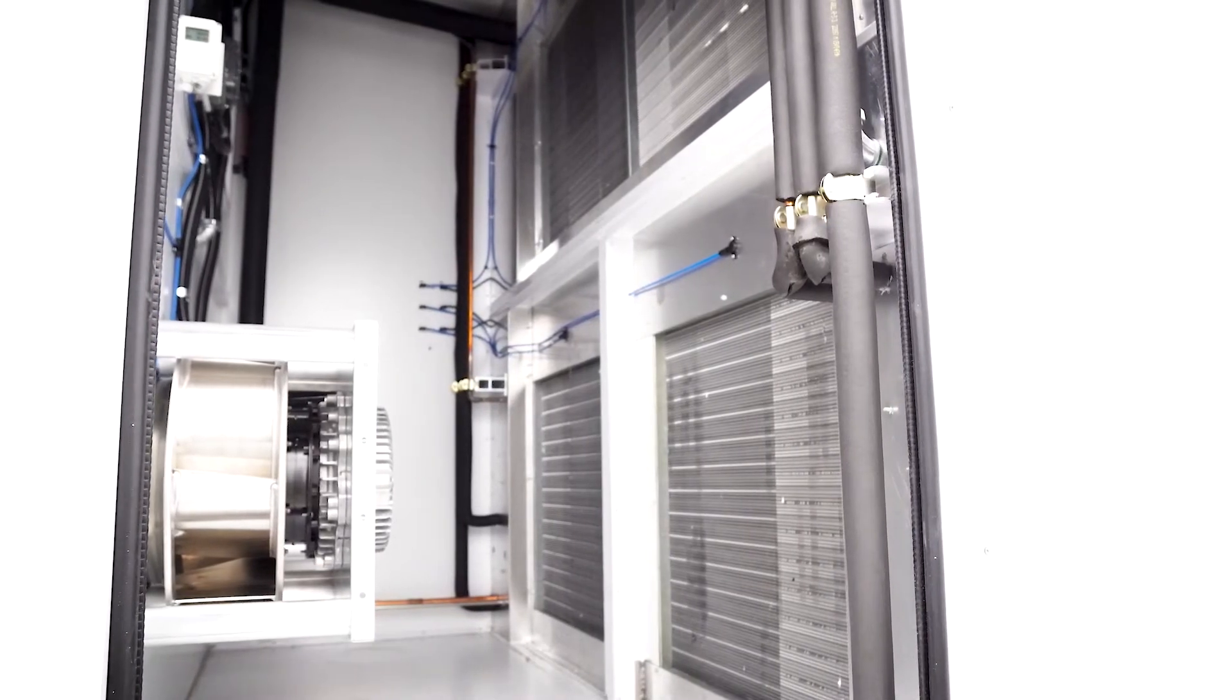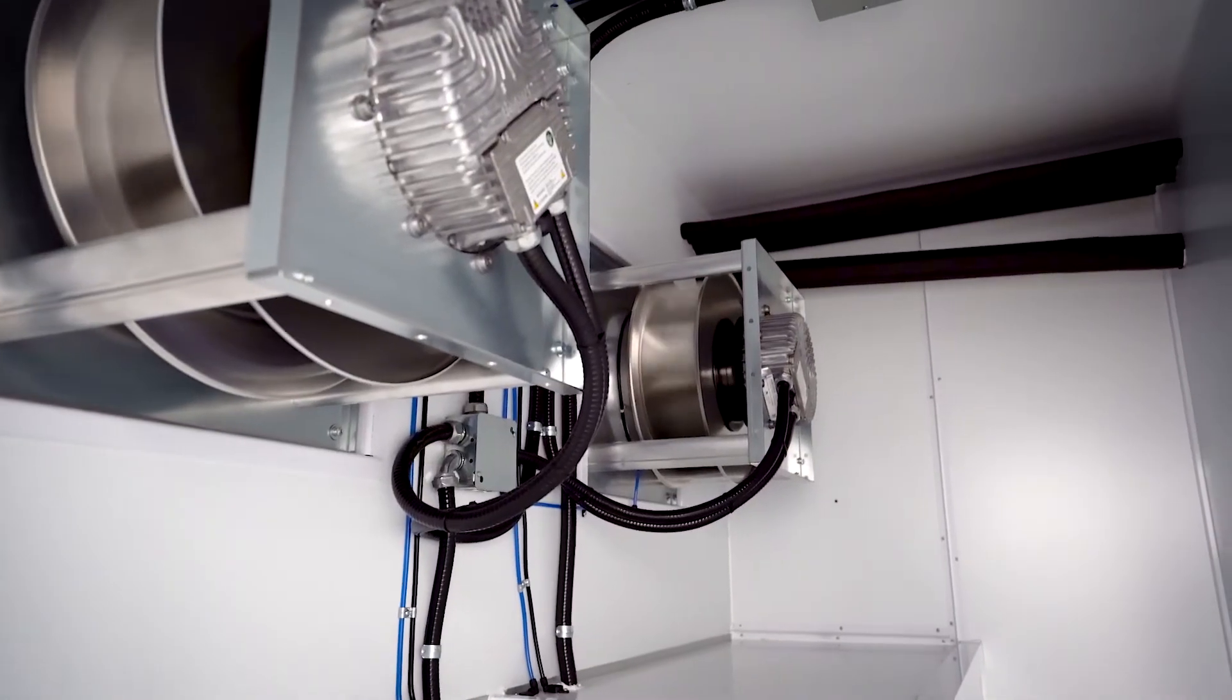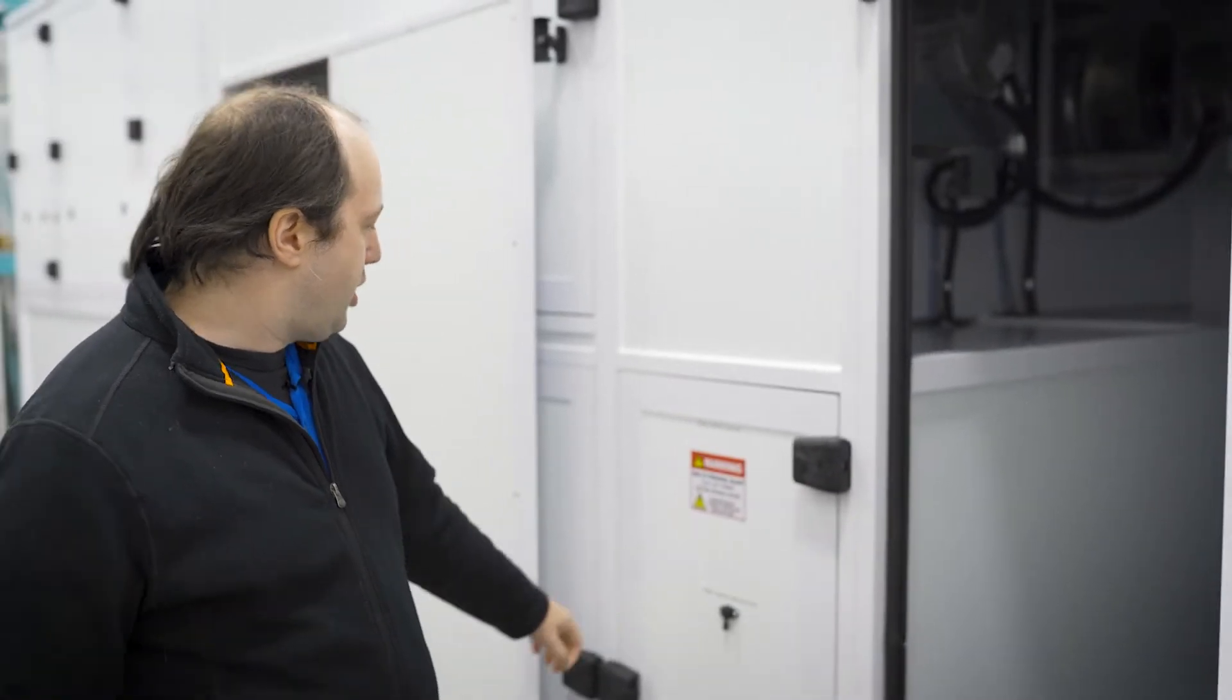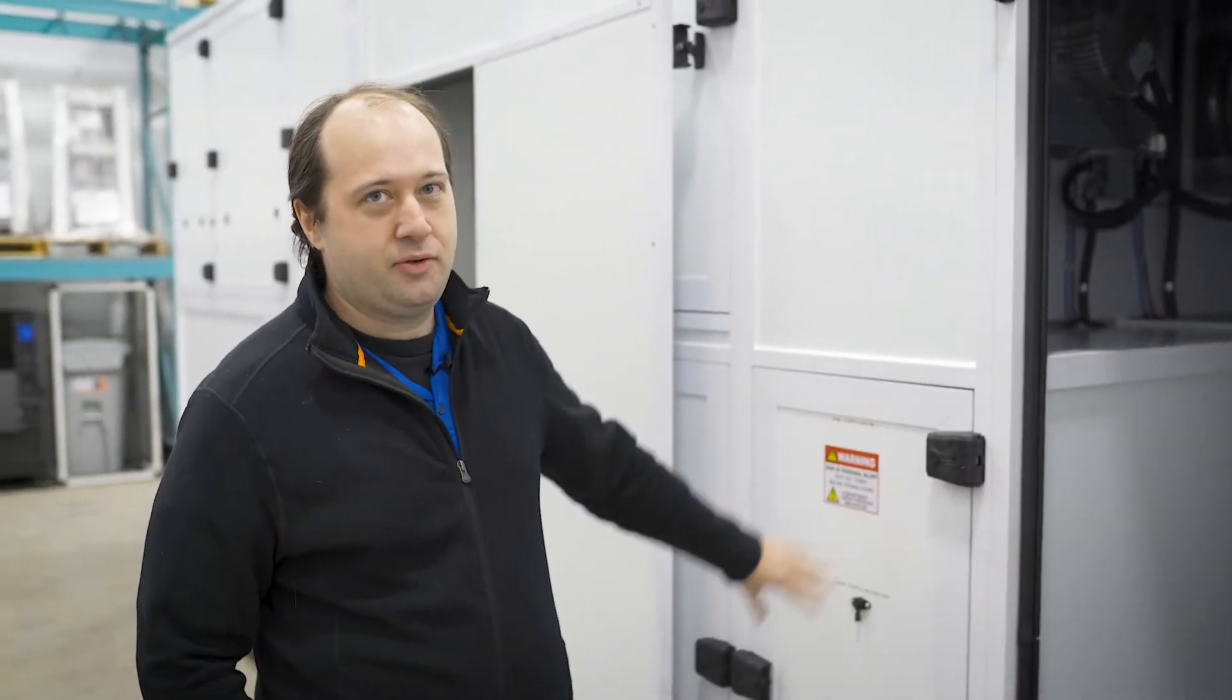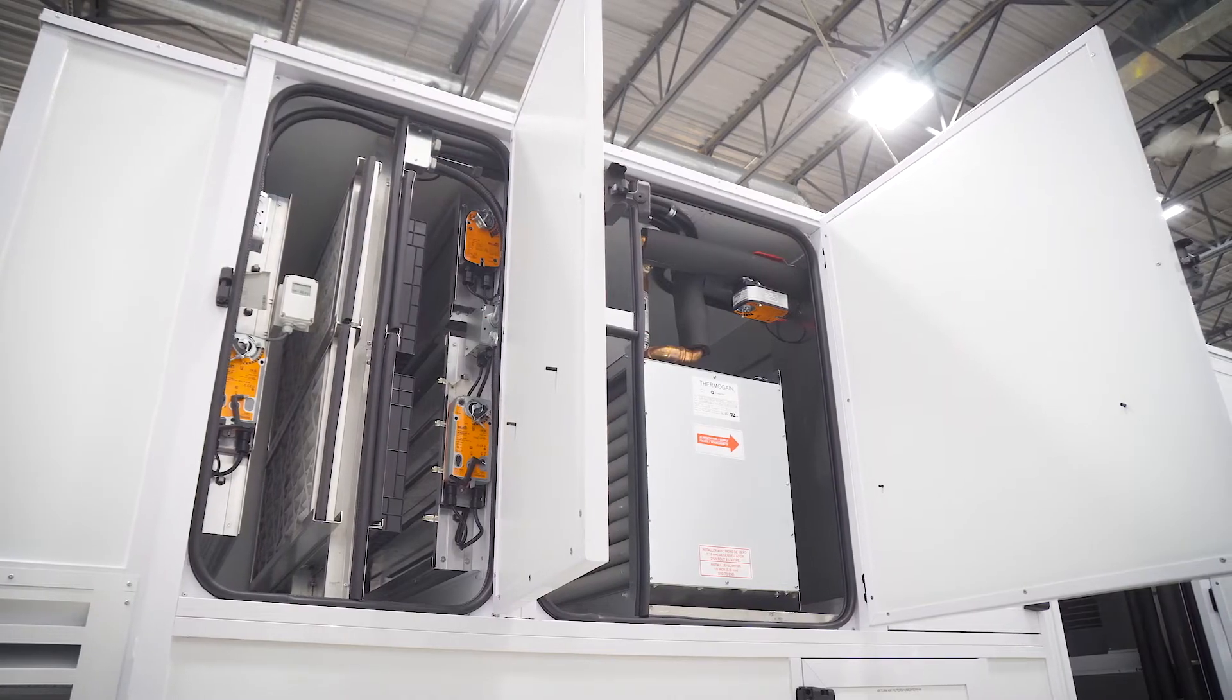In here we can see the two supply fans for zone three. Their opening will be in the floor so they'll go through the roof once it's installed. And then in here are the supply fans for zone one and zone two on the opposite side, also going through the floors.